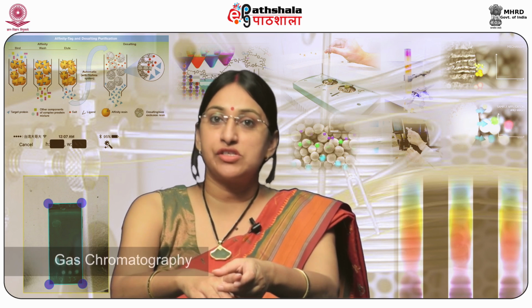Good resolution thus can be obtained by increasing N by lengthening the column, that leads to an increase in retention time and decreasing the band broadening. Secondly, by reducing the height equivalent to a theoretical plate by reducing the size of the stationary phase particles. Thirdly, by controlling the capacity factor K, separations can be highly improved. Then changing the temperature in gas chromatography can also give us good resolution, and changing the composition of the mobile phase in liquid chromatography can help to achieve good resolution.